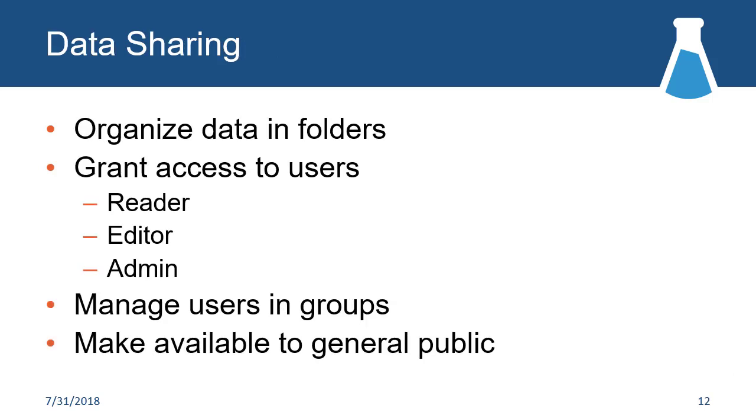And then one of the main scenarios, like Mike said, around Panorama is being able to share that data. So it's not just a Skyline document that you've got on your hard drive or on your USB flash drive or the like. It's something that you can give other people access to in limited ways, or give them full control.